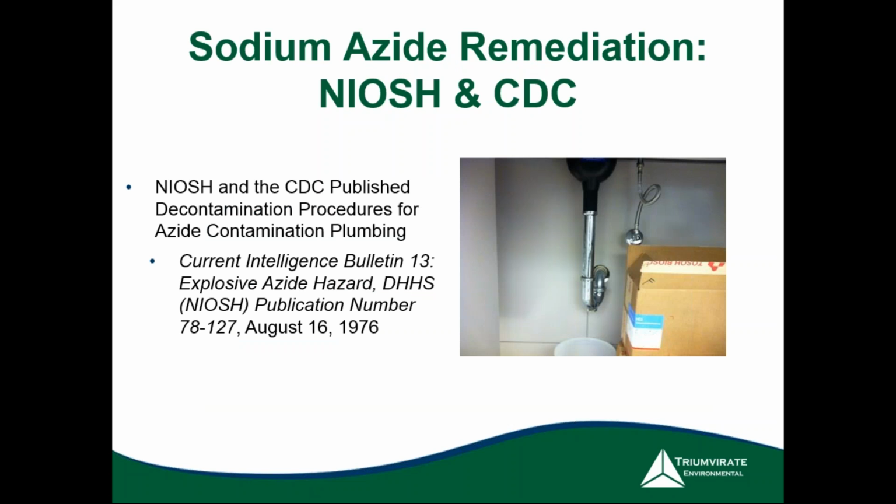But NIOSH actually published facts about sodium azide, including the fact that over a period of time, azide solutions discharged into laboratory wastewater piping reacts with copper, lead, and brass or solder to form an accumulation of lead or copper azides, which I explained are shock sensitive and explosive.